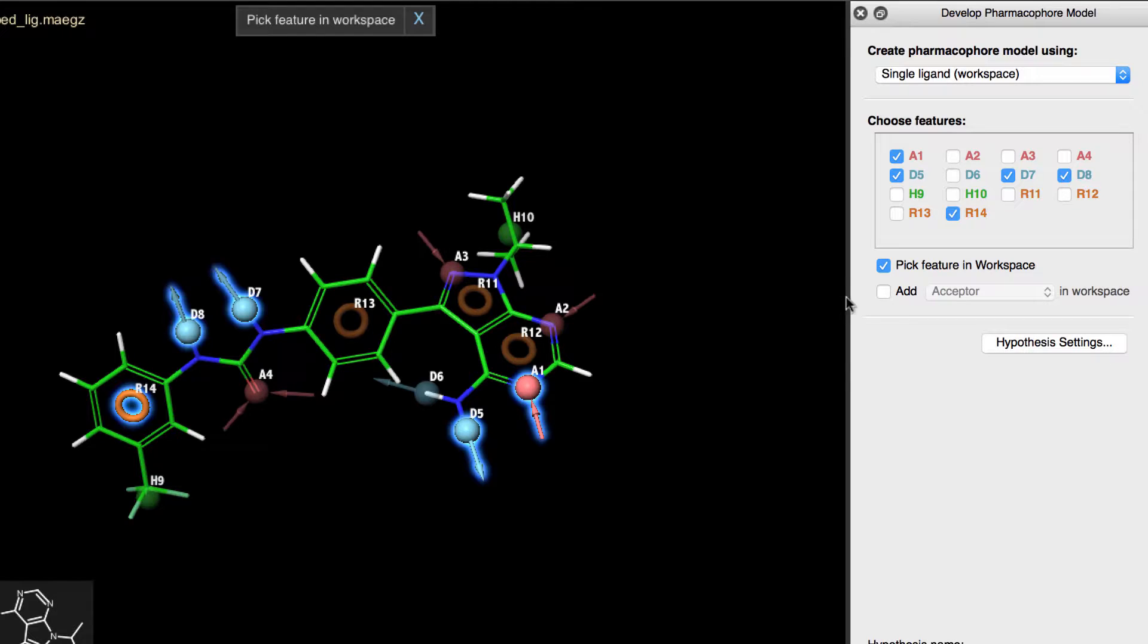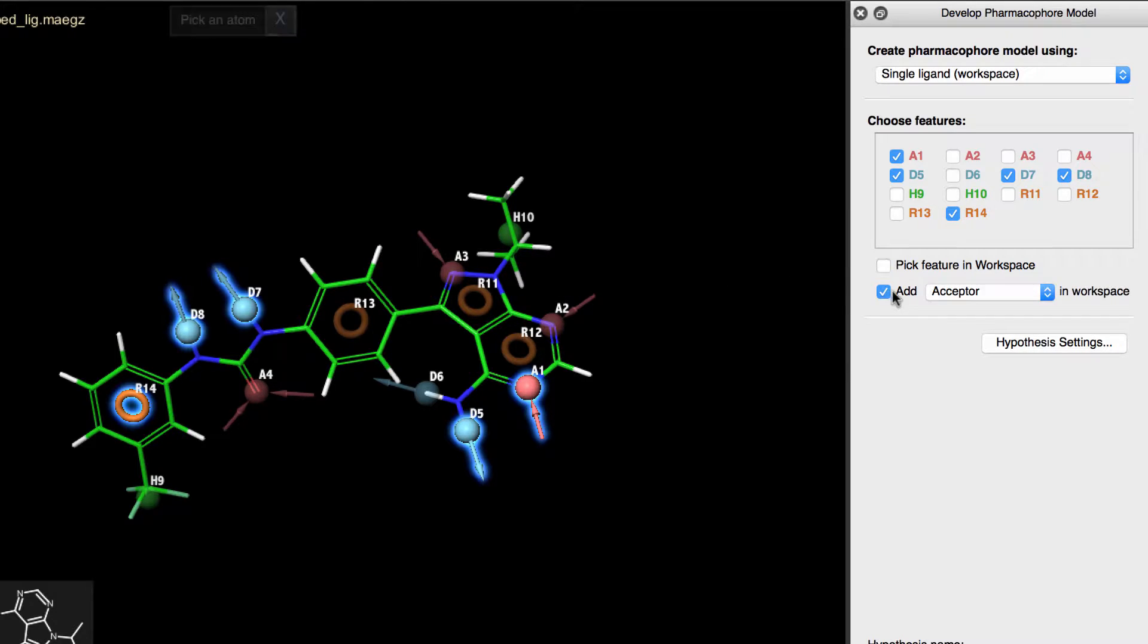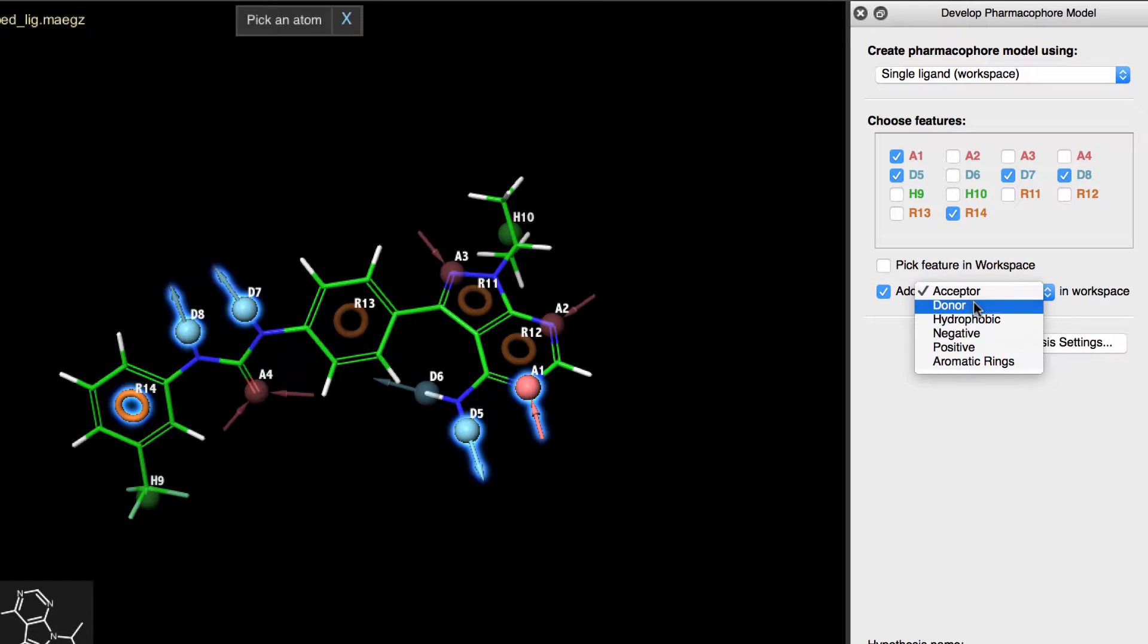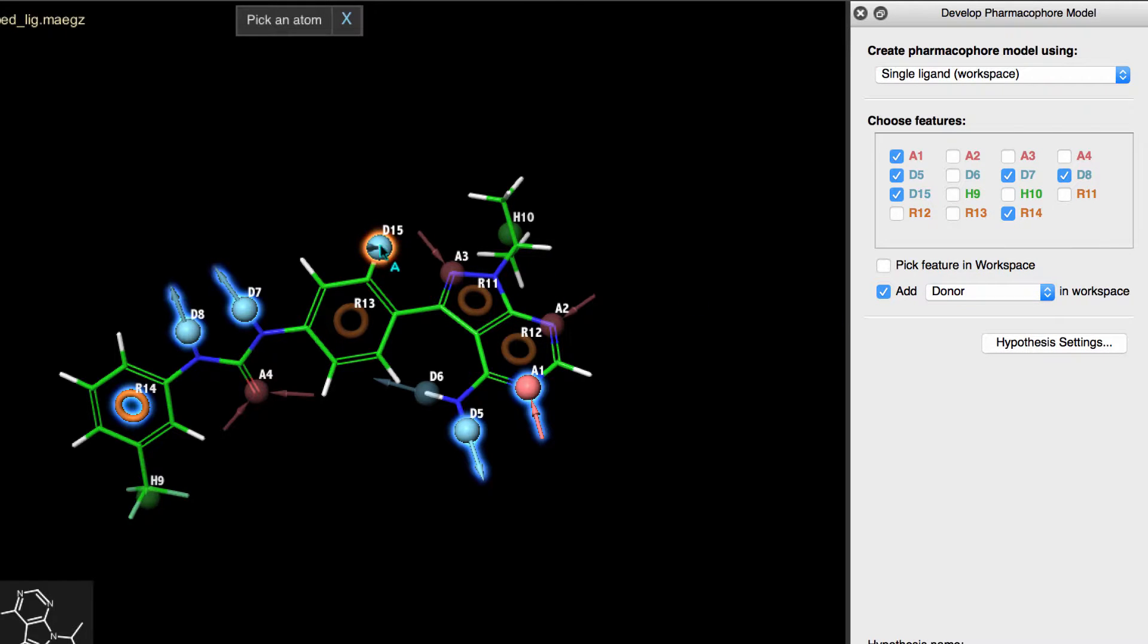Now, there's also an option here to add a feature manually. So, for example, let's say we wanted to add a donor feature where this hydrogen would be. We first enable the checkbox, change the feature to donor, then pick the atom to define the location in the workspace.